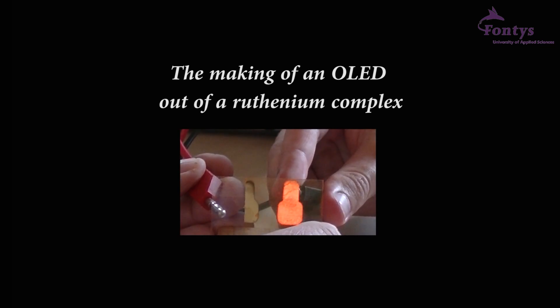Welcome to Chemistry Lab. Today we will show you how to make an organic light-emitting diode, most referred to as an OLED, with a ruthenium complex active layer. An OLED is a perfect example of a combination between organic and inorganic chemistry.